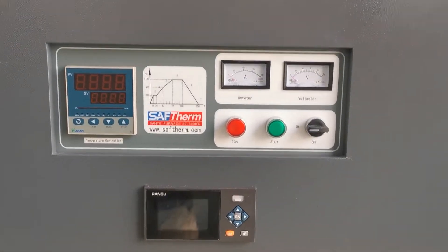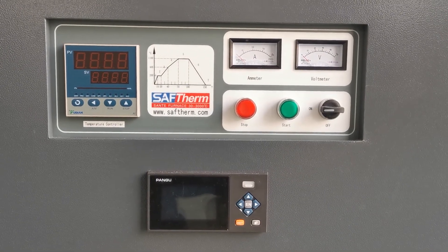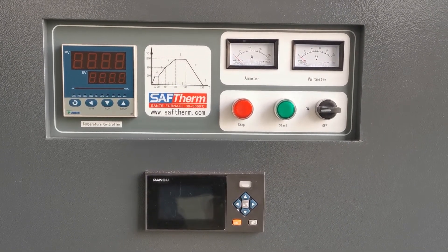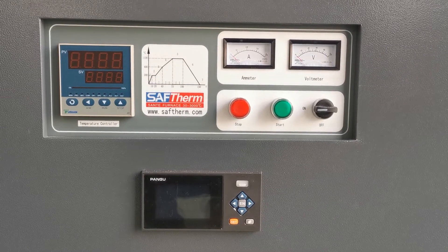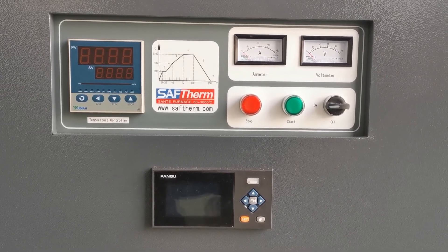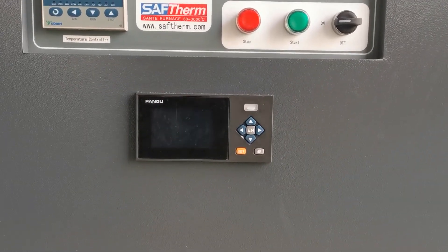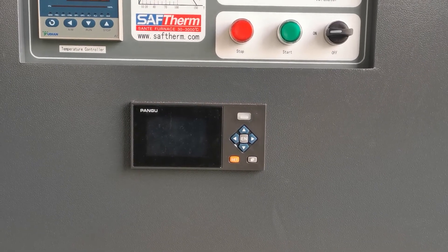Let's have a look at the control panel. The control panel is designed with an ammeter, voltmeter, button, switch, on, off, start, stop. The temperature controller can be programmed to 30 segments. The lower one is a paperless recorder.